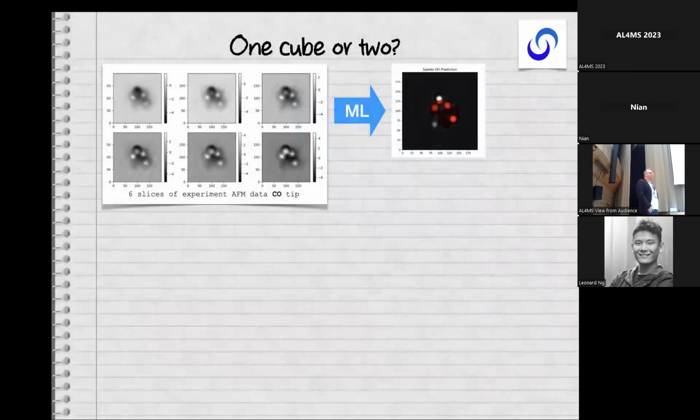So the first thing we did was take the original method, which has no training on water, no water in the database, and see if it works at all. And it wasn't bad. So we feed in the experimental data, exactly the same type of experimental data as before, but now we tell it the system is water. And we basically asked it to predict where oxygen and hydrogen are. We get a reasonable guess. You can see there's bits missing.